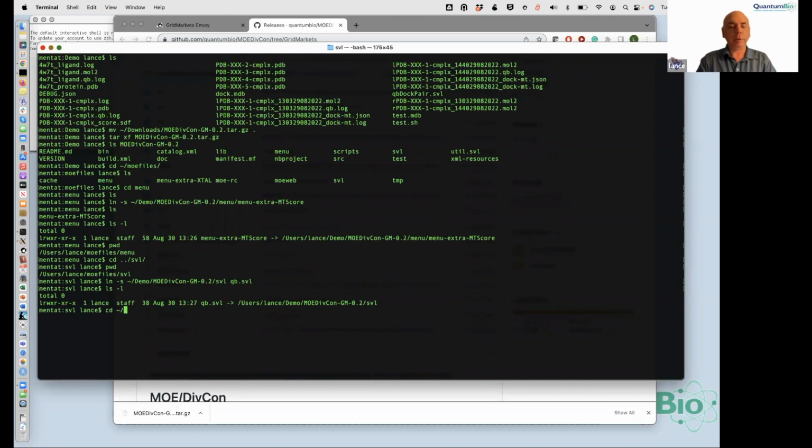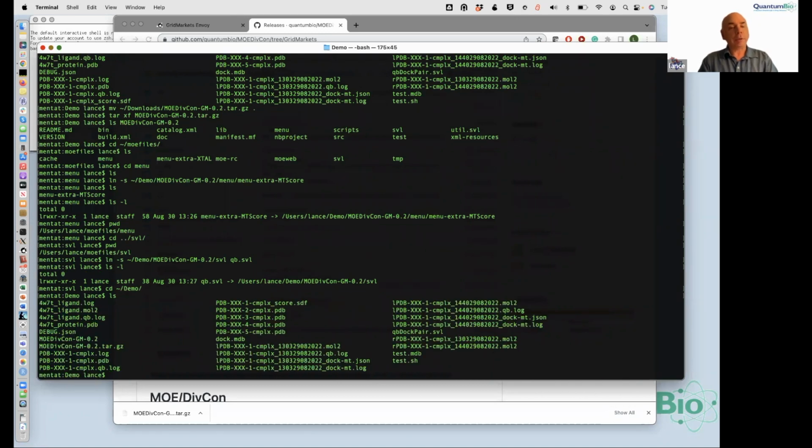Back into the demo directory. Now, once I've completed the installation process, once I start Mo, then you would be able to see all of these installed packages available.